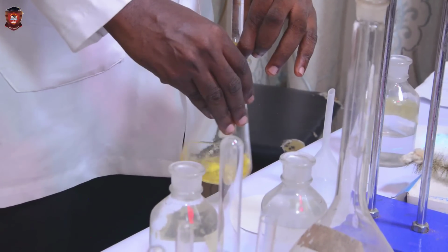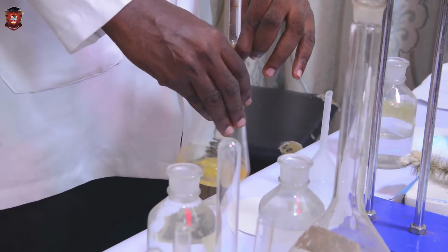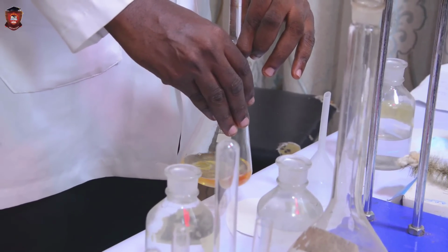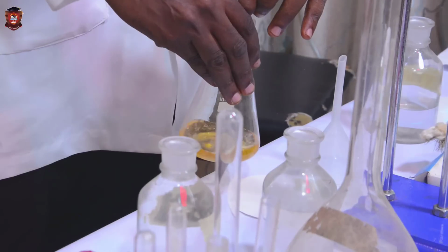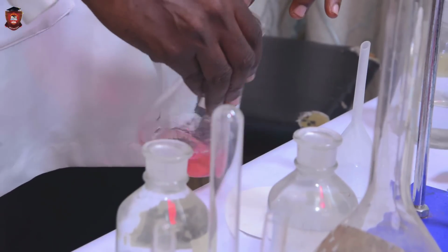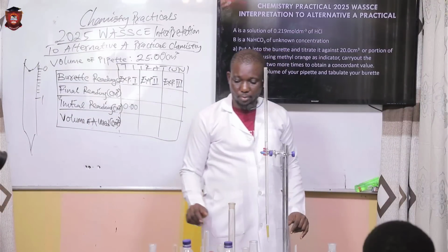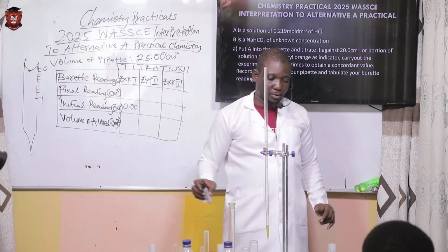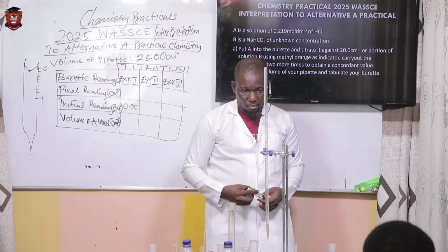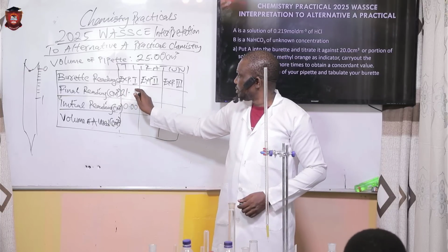You do this until the pink color becomes permanent. Is it permanent now? That's where you stop. That's where you stop. And then you read. Okay. What I'm having here is 21.80.